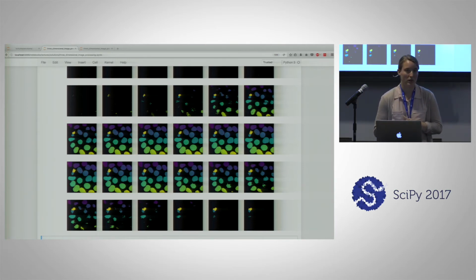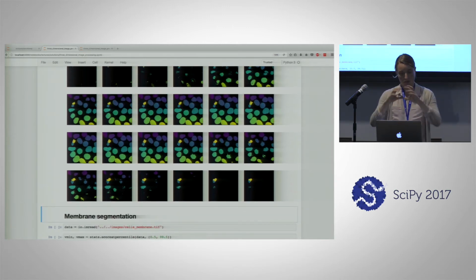That one's actually going to be a lot trickier to segment perfectly as one cell, because it does appear as two very separate, disjoint regions. But those cells in the middle that were over-segmented before, we don't have that over-segmentation problem here.